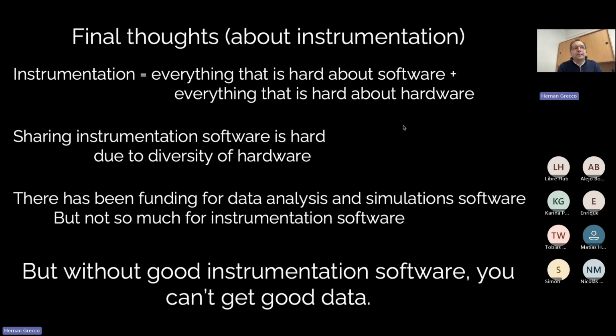First is that instrumentation is hard because it's everything that is hard about software plus everything that is hard about hardware. And sadly, instrumentation is not taught so much in the universities. I think we need to do more for this.